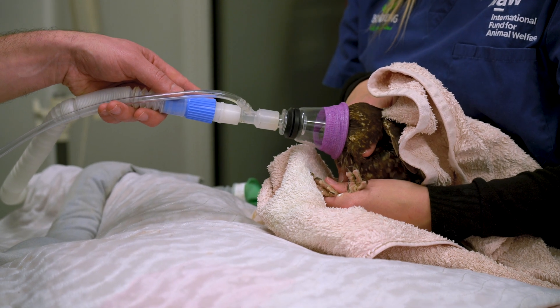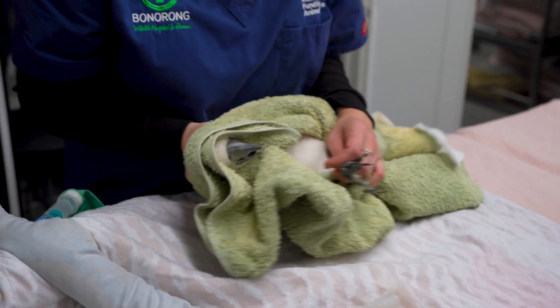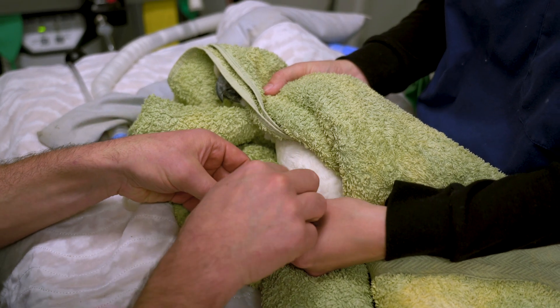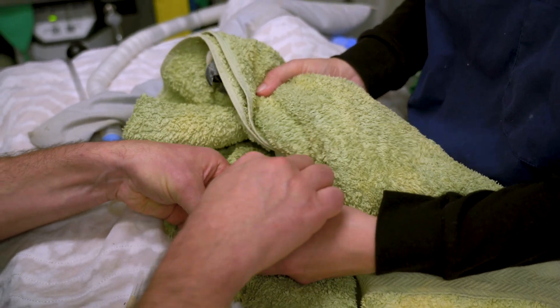Most of the time we collect blood from birds while they are anesthetized, but there's no reason why you couldn't collect the blood while they are conscious. As long as someone is restraining them properly, it shouldn't take very long to collect the blood.